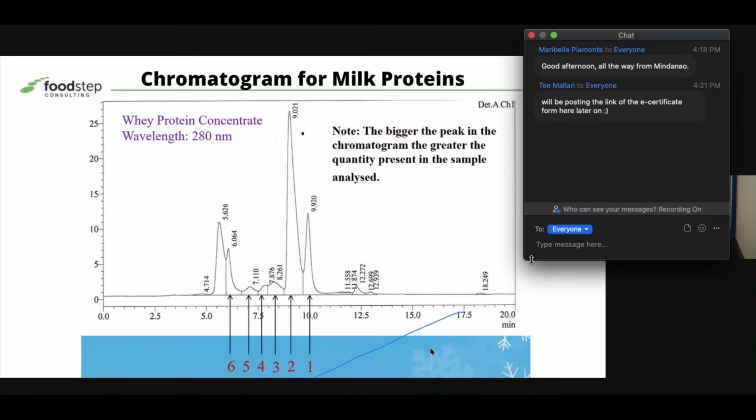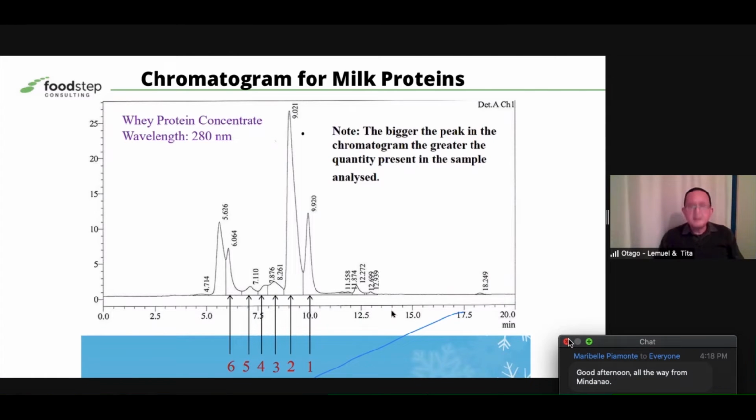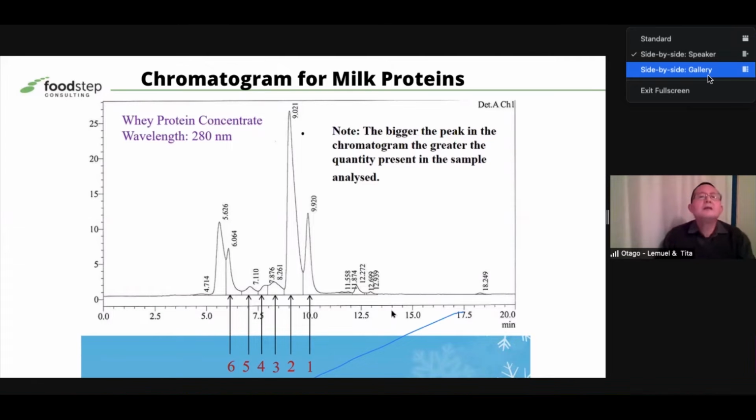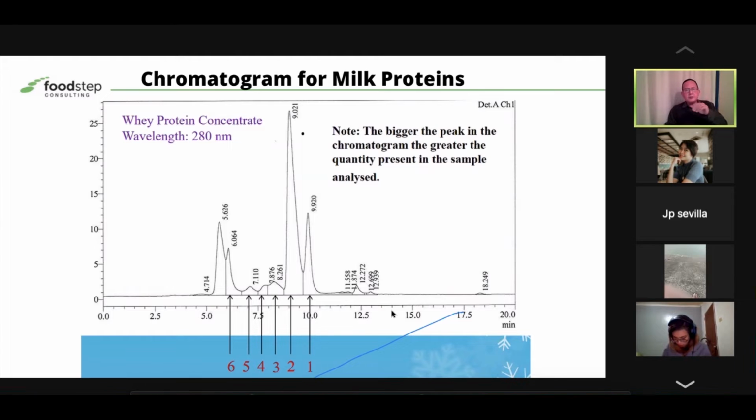And if you notice, in the chromatogram, the peaks come in various sizes. By the way, in the chromatogram, there will be other peaks. What it means is, if you need to identify these other peaks, you need to have a standard. But I suspect this bigger one here is probably leftover casein. Because if you recall, I said you can precipitate out the casein in skim milk, but sometimes there are still small fractions of casein left in the whey. So this might be just a fraction of the casein, and there are others here which I have not identified.